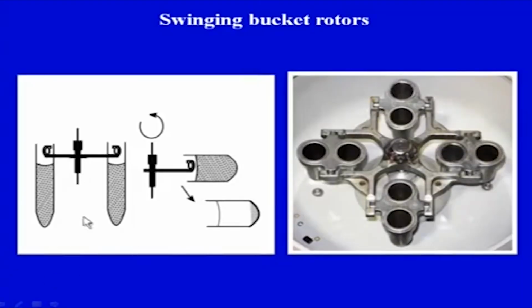So, here you can see these are the tubes and they hang in here, and then they extend outward in this fashion. These are like large buckets where tubes could be placed; these are swinging bucket rotors. Remember to balance them: if you are putting 1, 2 here, then 2 balance has to be here. Large samples could be put in here. So, these are swinging bucket rotors.